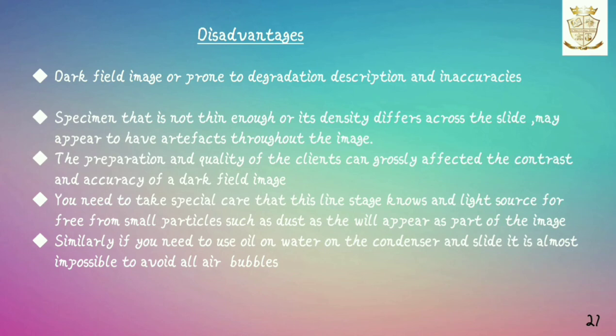And similarly, if you need to use oil or water on the condenser and slide, it is almost impossible to avoid all air bubbles.